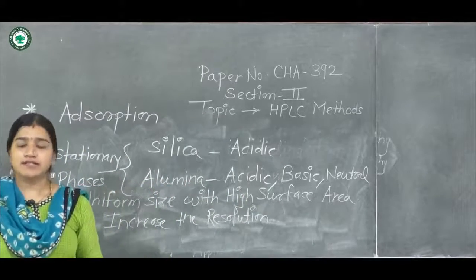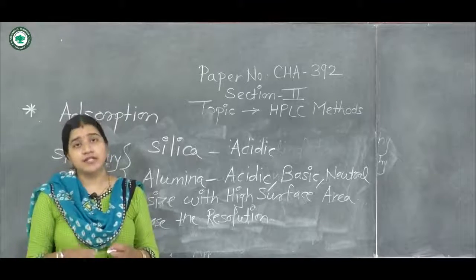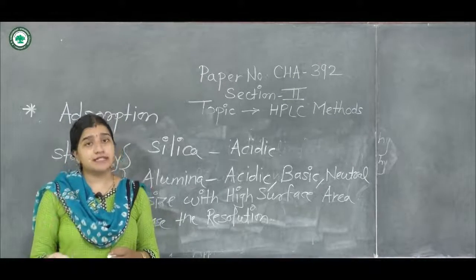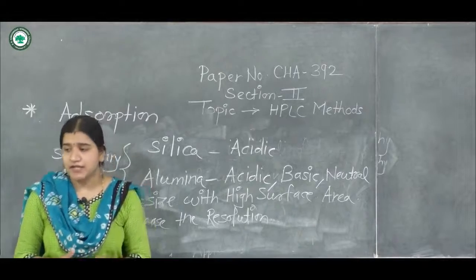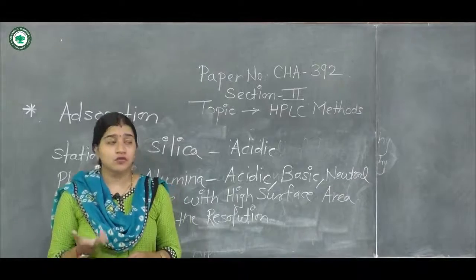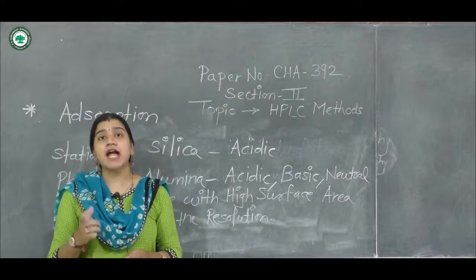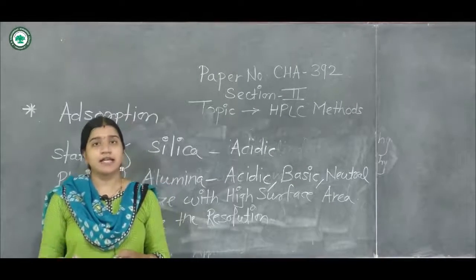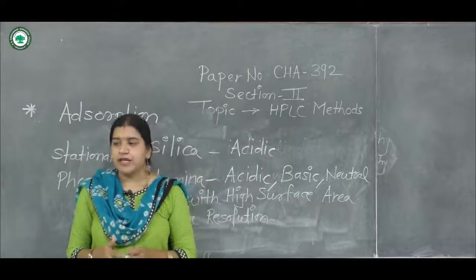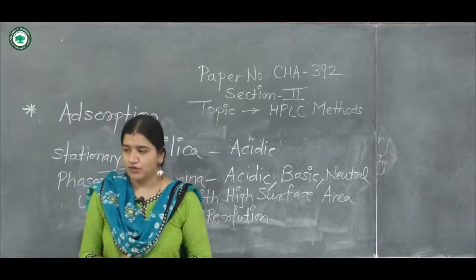Now, after studying this topic, you have to decrease the particle size and increase the surface area, because an increase in the surface area and a decrease in the particle size will increase the adsorption, because all of you know that adsorption is a surface phenomenon. So an increase in the surface area will increase the adsorption, and hence it will increase the resolution power or the resolution. Hence you should always use a stationary phase of uniform size.